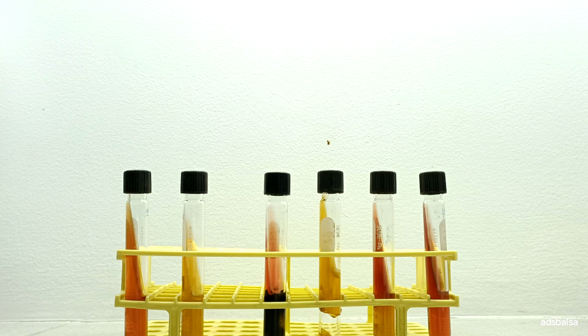It is also used to distinguish the Enterobacteriaceae from other gram-negative intestinal bacilli by their ability to catabolize glucose, lactose, or sucrose, and to liberate sulfides from ferrous ammonium sulfate or sodium thiosulfate.